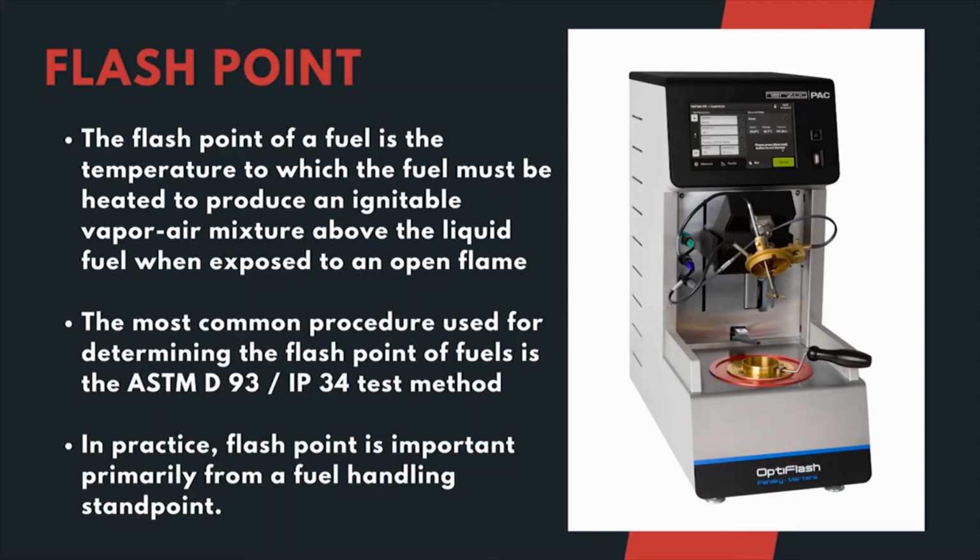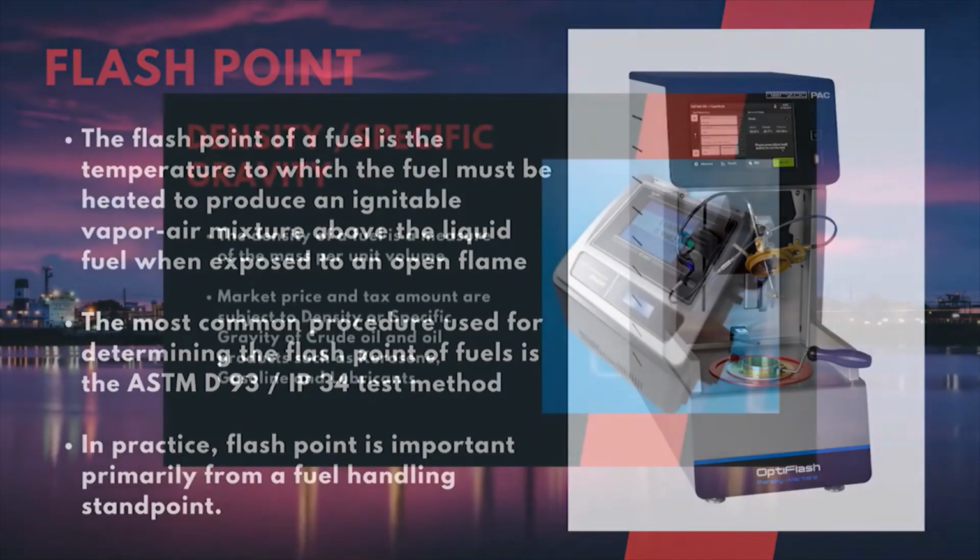So, that is the tipping point. So, this is primarily an indication of safe handling of the fuel. The most common procedure used for determining the flash point of the fuel is the ASTM D93 IP34 test method. In practice, flash point is important primarily from a fuel handling standpoint.